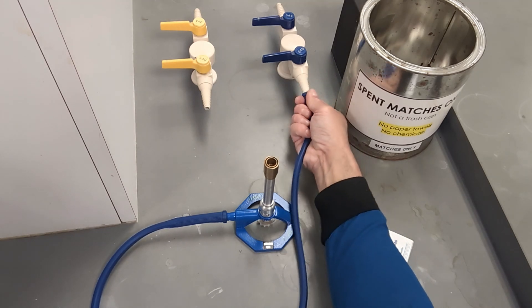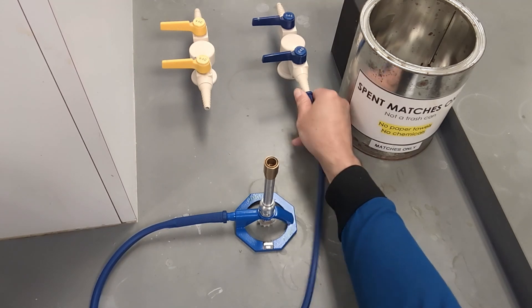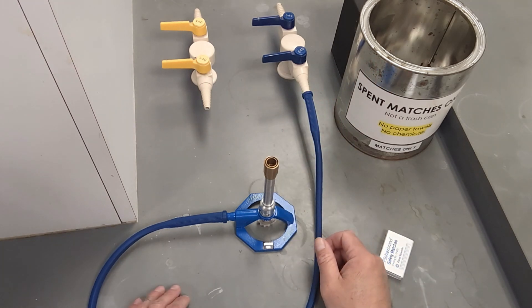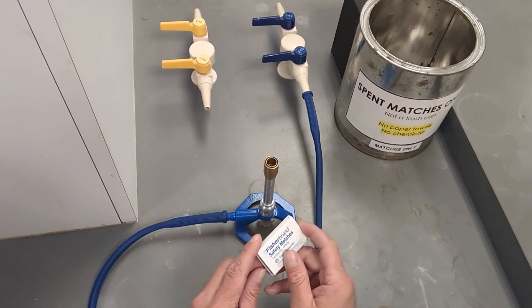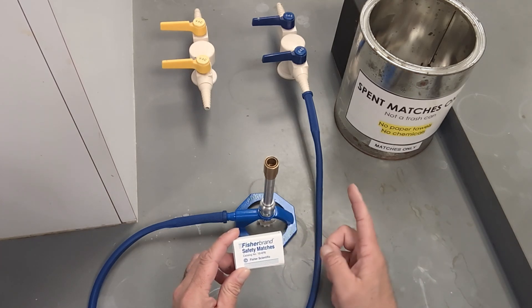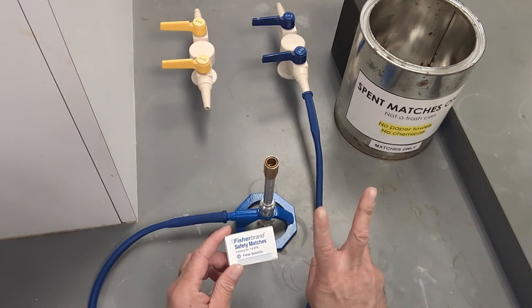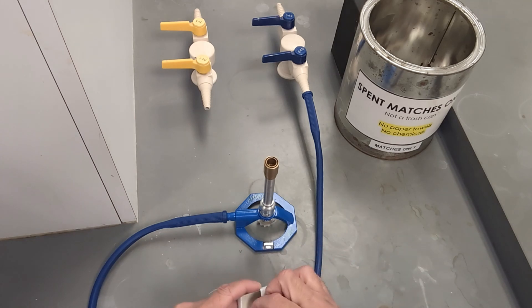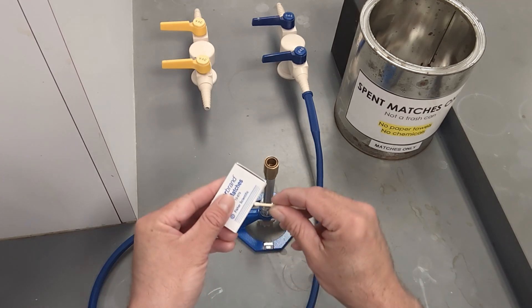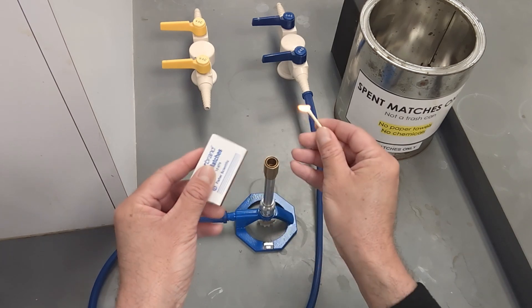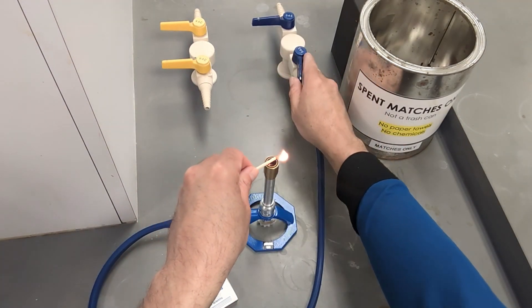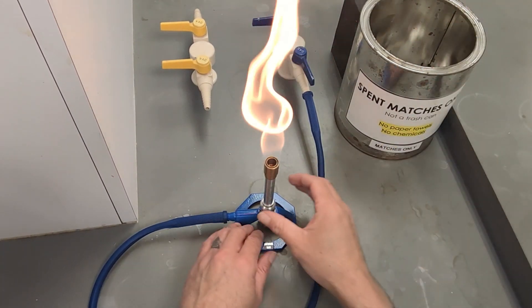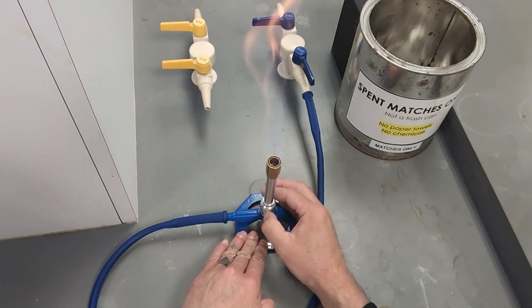And before opening the gas valve we need to be sure that our match is lit. So the first thing we are going to do is open our match box, and then after that we are going to open the valve. And be sure to extinguish your match and dump it into the spent matches.